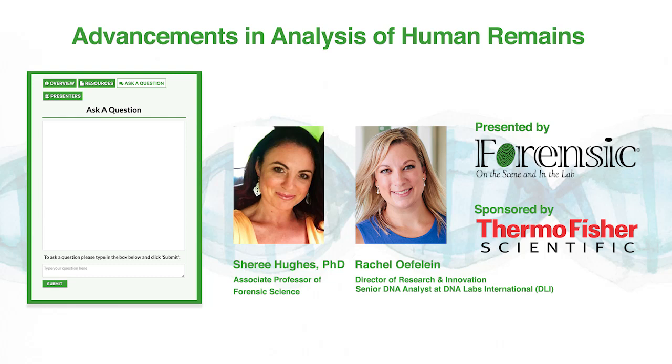Gotcha. Okay. Last question, as we're running out of time. Did you try to use freezer mill for powder? We did not. We used to use blender cups, and then we moved on to mixer mill.